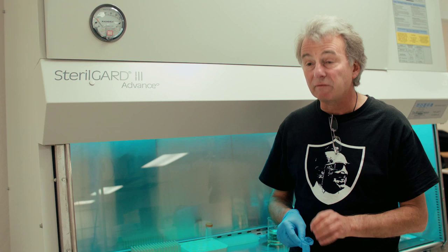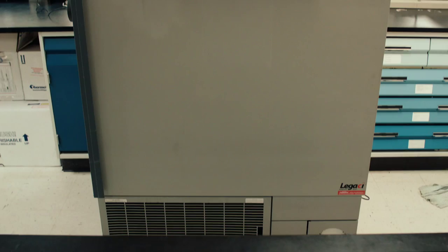And being an infectious agent, it has special precautions to handle it. I'll put on my gloves, even though the virus at the moment is sitting in the minus 80 degree freezer.